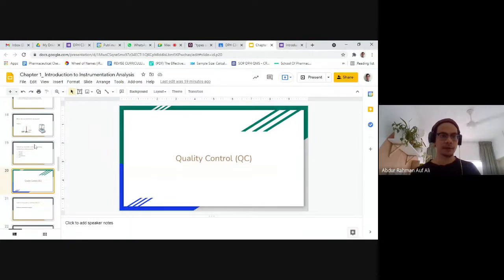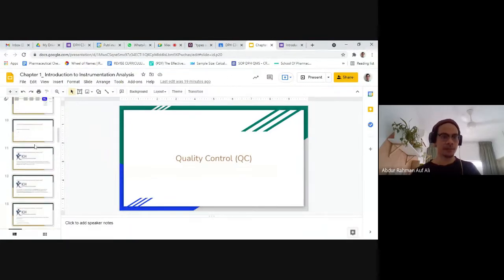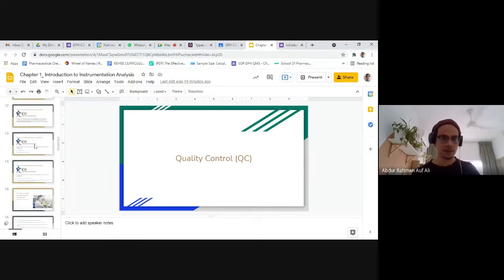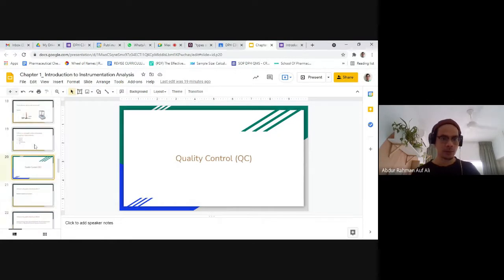Okay, so chapter number 1 kita dah cover in the beginning tadi saya dah cover with the lecture, how do we perform test in essence, ada kita follow pharmacopoeia, and we develop an STP, standard test procedure punya book based on pharmacopoeia, and kita perform multiple types of tests. And some of them adalah macam saya tunjuk tadi, appearance test, assay test, and in detail saya cerita tadi adalah identification test. Macam mana kita perform identification test by comparing our tablets dengan a reference standard. Okay, so that's the part yang kita dah go through without referring to the lecture note.